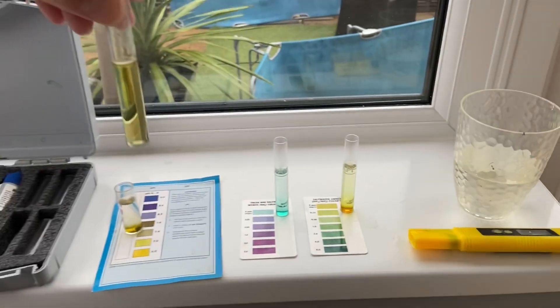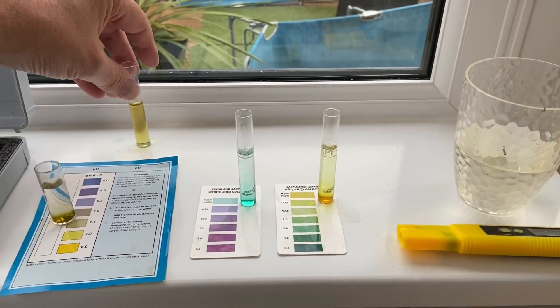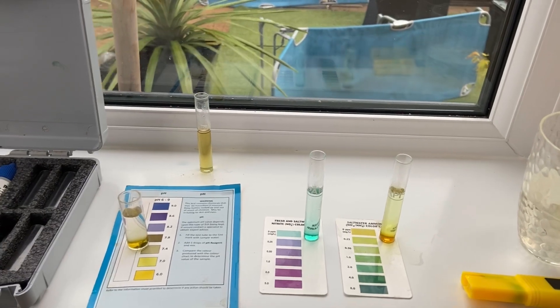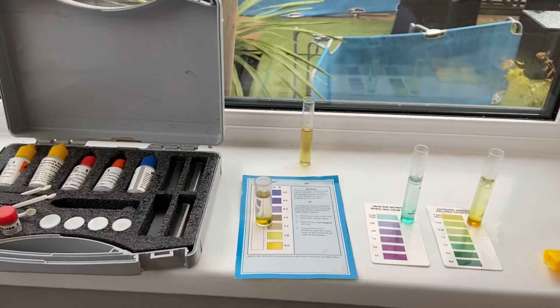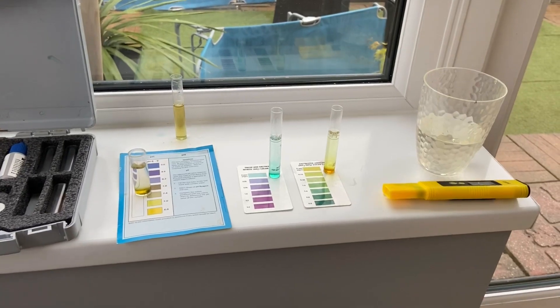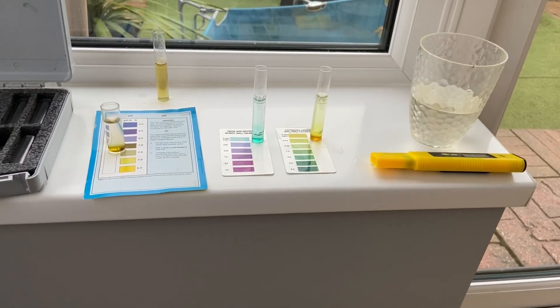It took three drops for the blue color to change on the KH test, so my KH is pretty good. I may buffer it slightly in the morning just to give it an extra bit — it will bring it up a little bit. I like to keep it around four drops if I can. Some of these test kits are a pain to read.